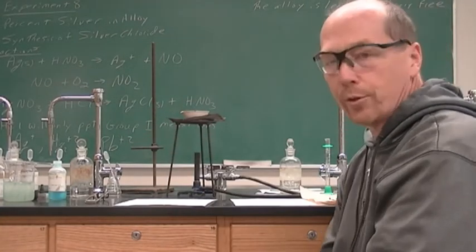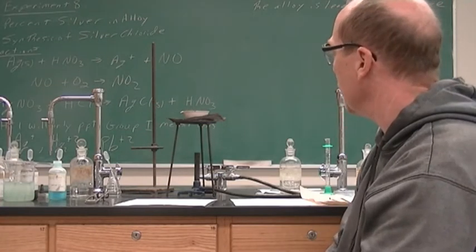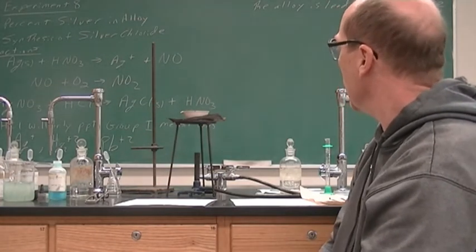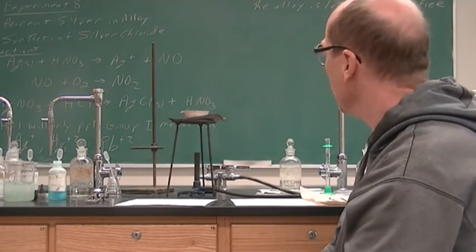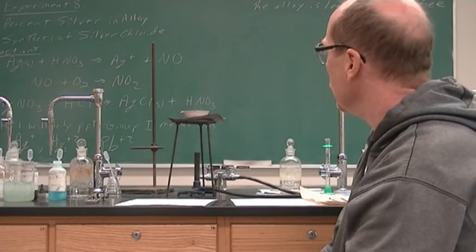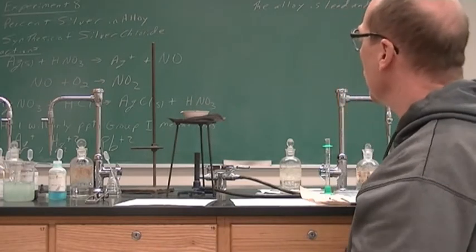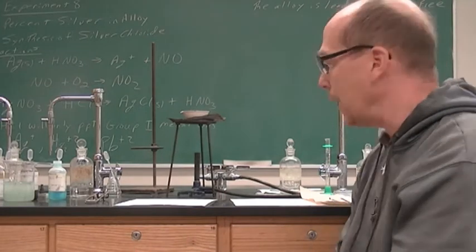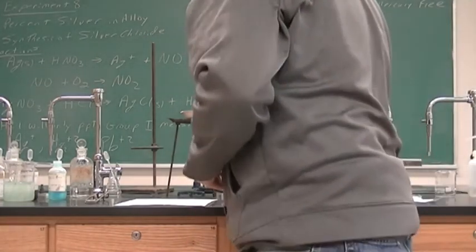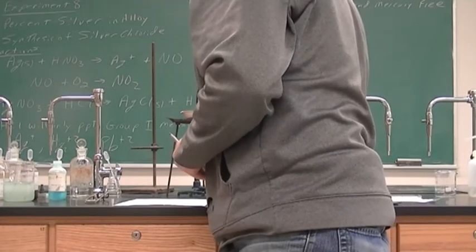That will add another 30 minutes to your boiling because it condenses on the top of the lid, and so the amount of error for the very small amounts that will come out is not a problem. Again, we know we're going to have lab error, and it's good to know how to calculate those errors, but we won't be doing that. All right, it's getting very close.